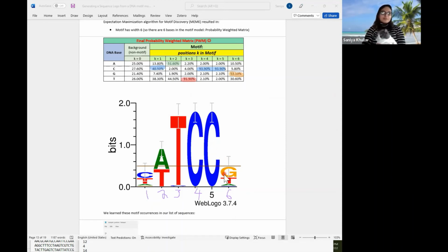Like here, it could be kind of 3 bases, like it could be G, T, or A. But here it's more split between 2. So even though this is less than this, it can be between 2. It's like summer, you know, it can be rainy or sunny.